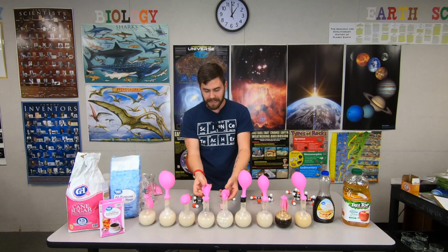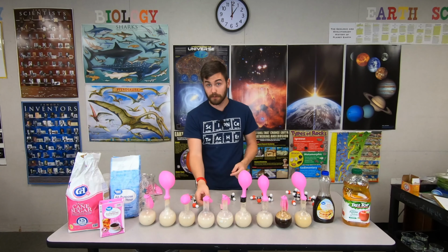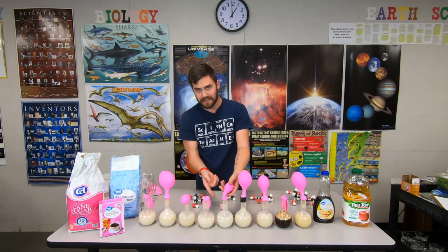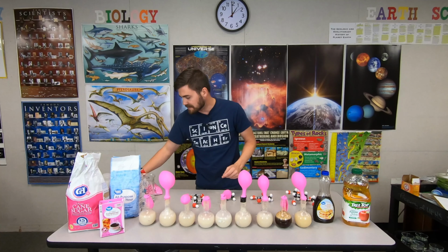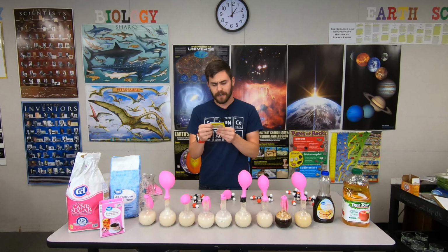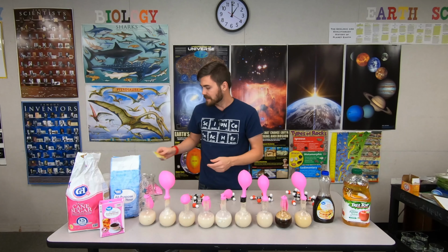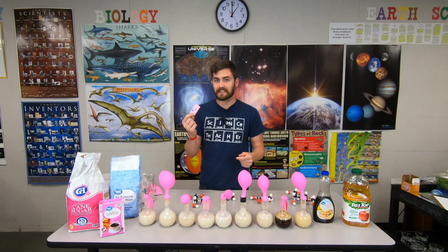Now, the artificial sweetener. These should be identical to our control group. This one has a little bit of gas in it, which is surprising. What could have happened is this yeast has a coating around it, and I think that coating is technically digestible by the yeast, so perhaps a little bit of gas was produced from that. But let's talk about artificial sweetener. It has no calories. It's not food.